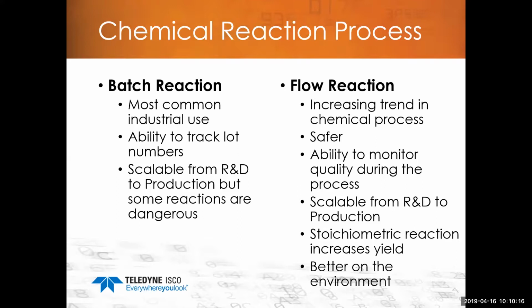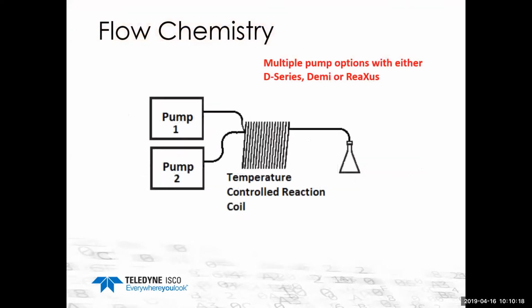When you look at what flow chemistry really means, this is very basic, but you're pumping multiple reagents into a controlled reactor and out comes something else. Very, very simple. I know there are much more difficult setups and applications, but this one here is very simple.